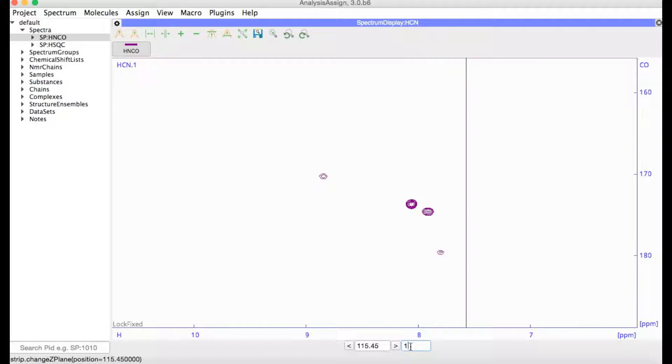Here on the right, you can see the plane count. At the moment, by default, I see one plane at a time. But in some instances, it could be useful to view several planes at once.